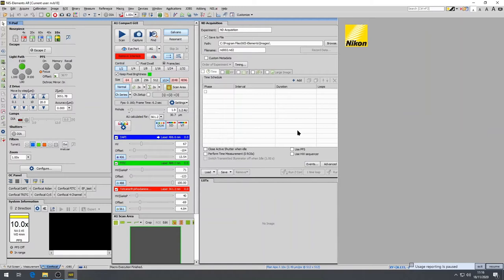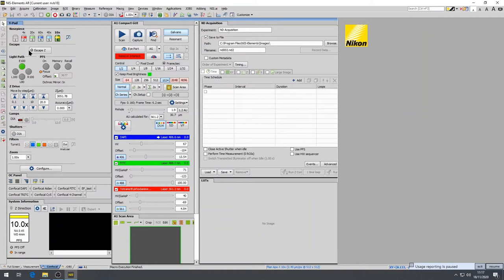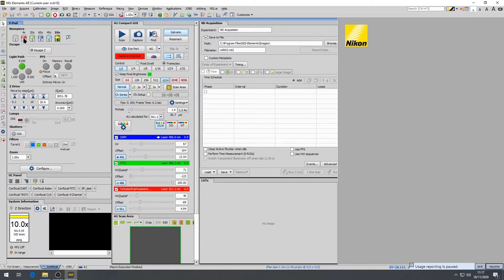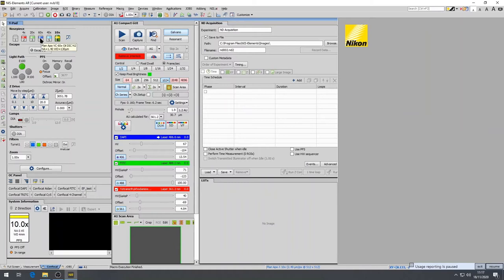One of the most important windows is the TI Pad which is an interactive panel that allows for the direct control of the microscope. In general, the only proportion of this window that you will be using regularly are the objectives. Here are all the available lenses which are highlighted and indicating magnification. And if you hover over them with the mouse you get a lot more information about the objectives such as numerical aperture, working distance and more importantly immersion type.